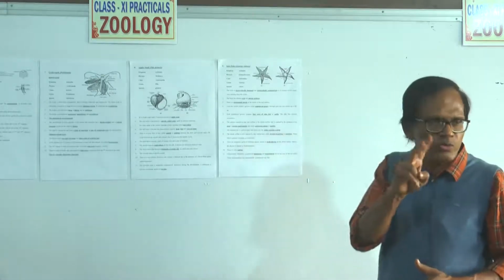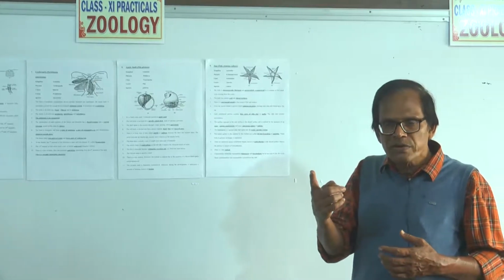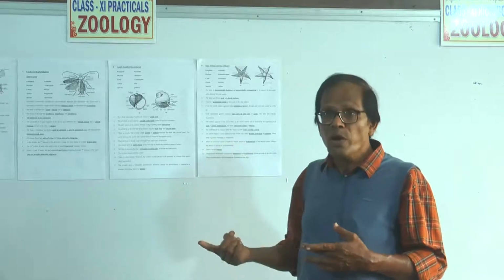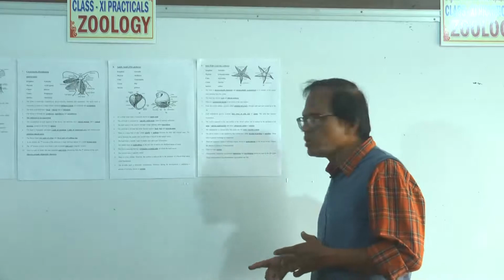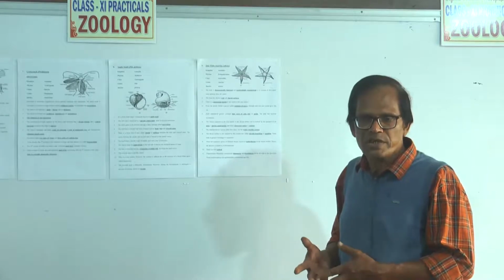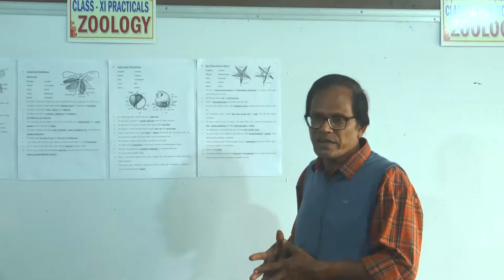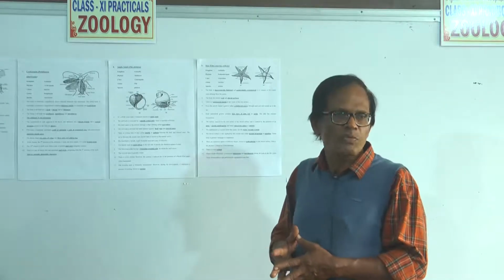These are two larvae. One is Bipinnaria. The next larva is Brachiolaria. Brachiolaria finally metamorphoses into a miniature starfish. This process is known as metamorphosis, a transformation process through which a larva changes into a miniature form of the adult.